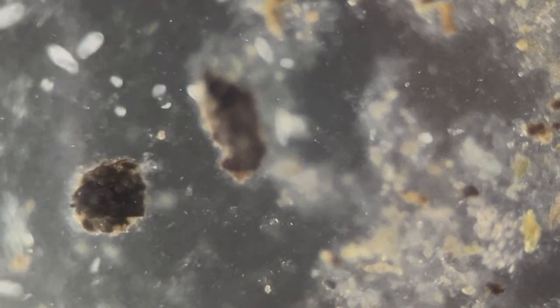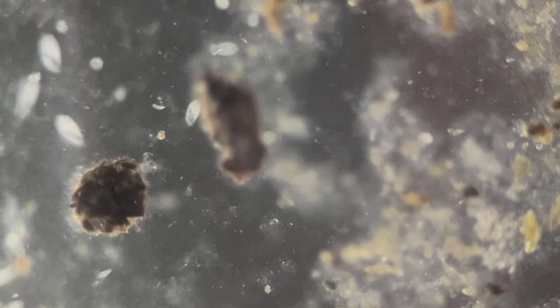Let's try to give some of these creatures in focus. Okay, we'll move off, search the worm again, where it has gone, and see if we can trace out more of its anatomy by this reflective light system. Must be somewhere around here.